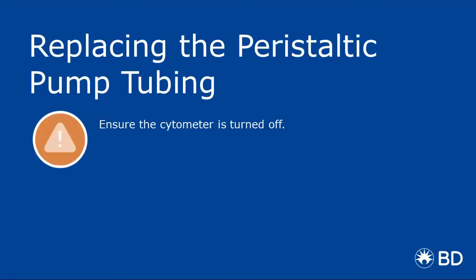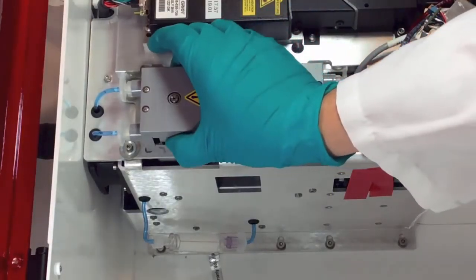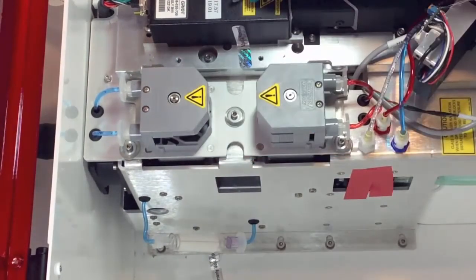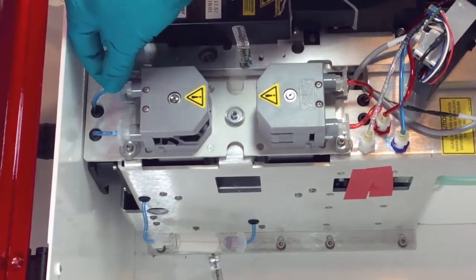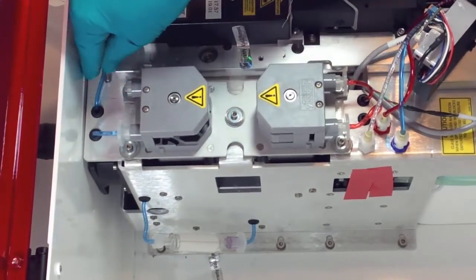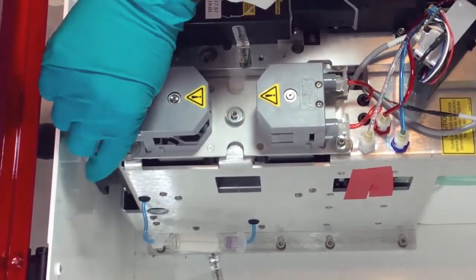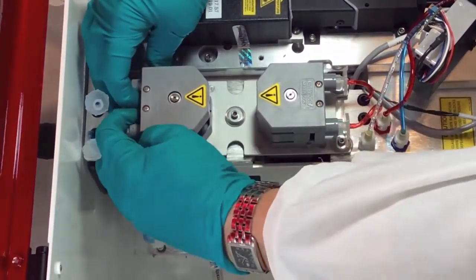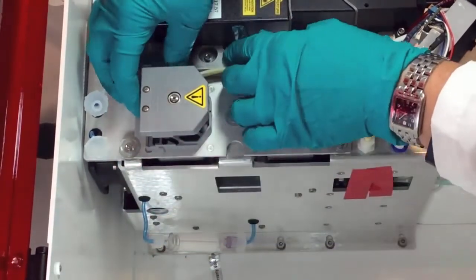Finally, we'll cover the procedure for replacing the peristaltic pump tubing. Squeeze the grip marks on the pump retainer clip to remove the clip. Disconnect the tubing by unscrewing the luer connectors. Carefully pull the luer connectors outward, sliding the fittings off the pump head, and then discard the tubing.